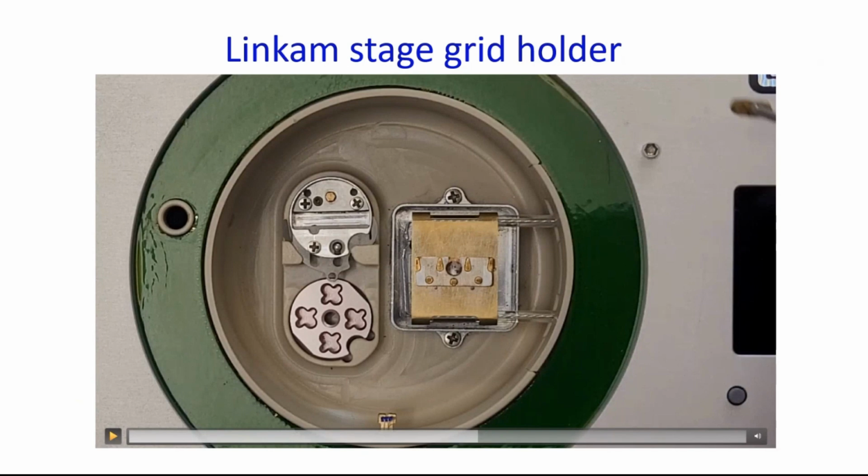So all of this is great. You get very little contamination. You do your mapping of the grid. You look at the quality of the ice.